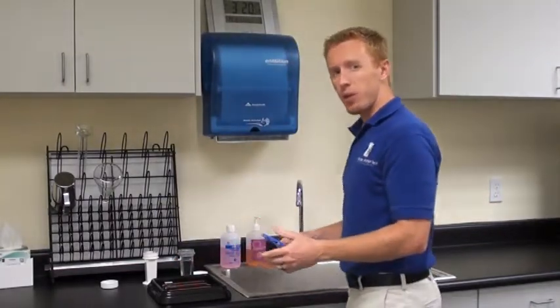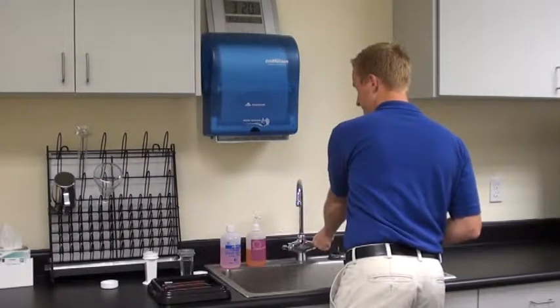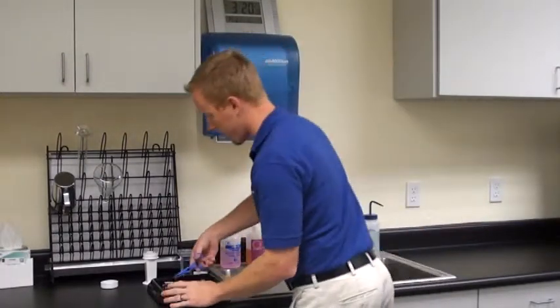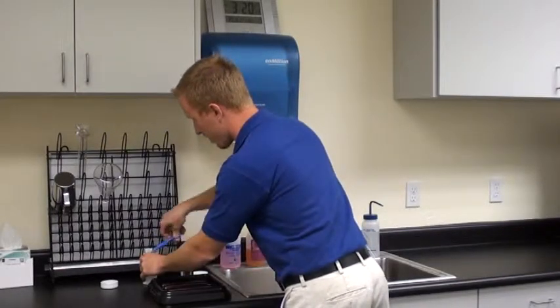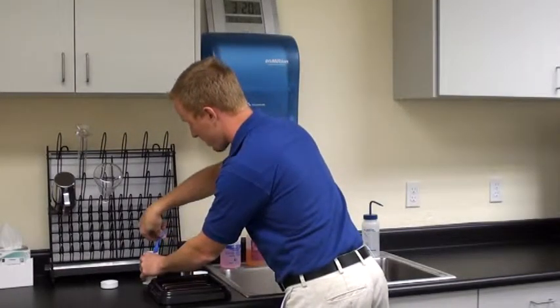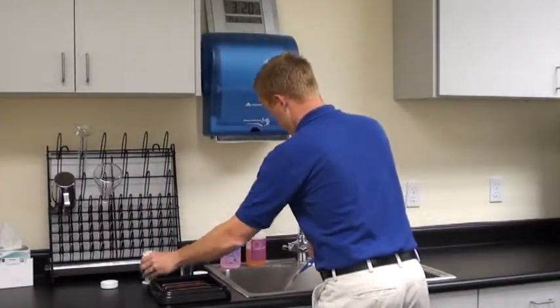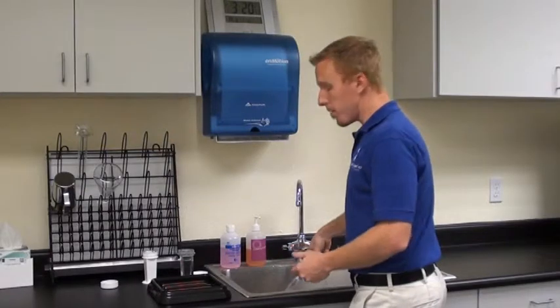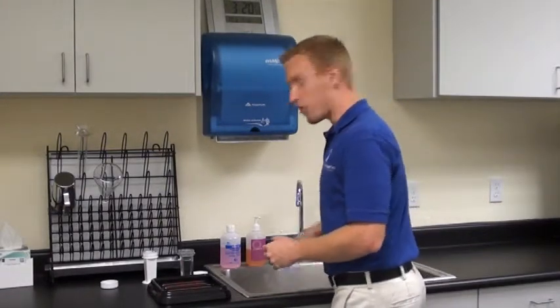We use full strength Harris hematoxylin, which means you just need a quick 1 to 2 second dip. Then rinse it off in water, put your slide in alcohol, and clear and cover slip as usual.